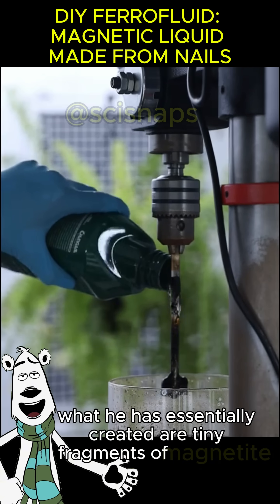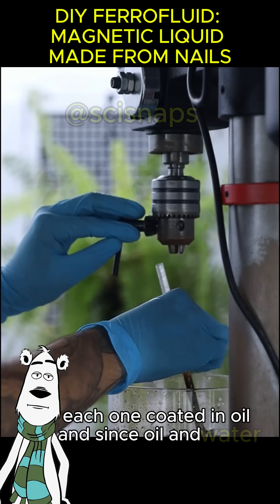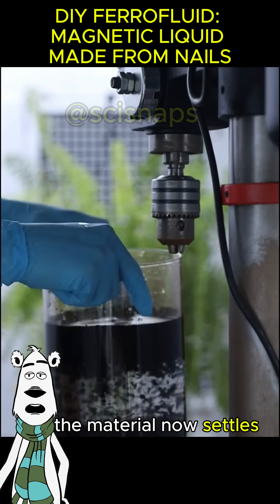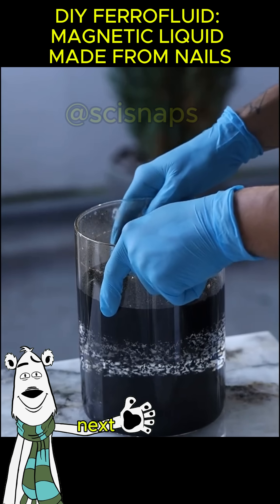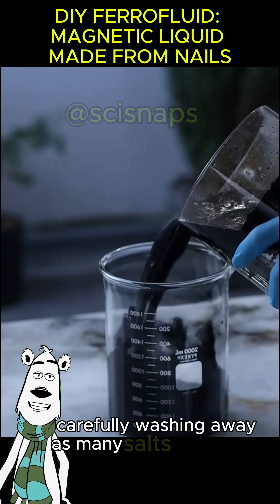What has been essentially created are tiny fragments of magnetite, each one coated in oil. Since oil and water never mix well, the material now settles much more easily. Next, the purification step begins — carefully washing away as many salts as possible generated during the neutralization reactions.